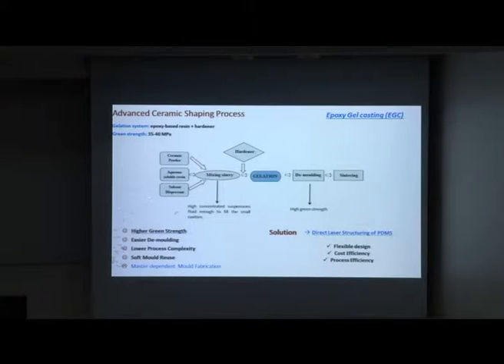This technology is still dependent on a master for the mold fabrication. The solution, as I said before, is structuring the PDMS directly by laser ablation. With this we can have a more flexible design, and we can significantly improve cost and process efficiency.